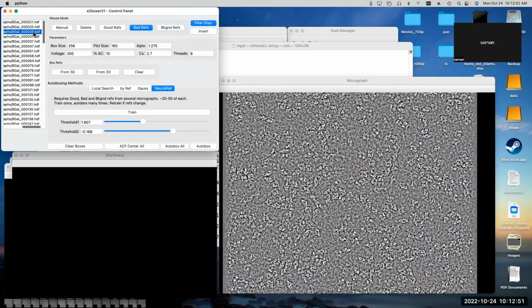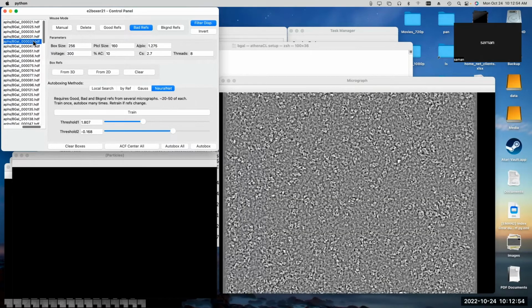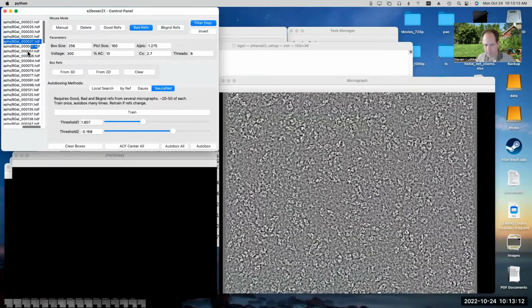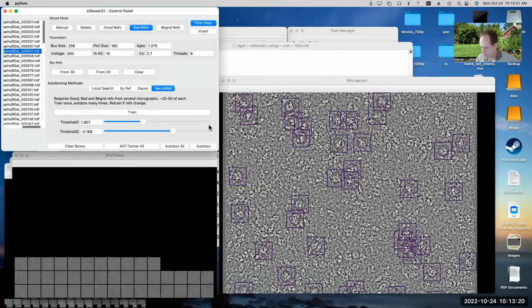I have a question. So if the final resolution of the 3D structure is disturbed because of the bad references, how can we identify that? Like you said, sometimes it is the resolution, sometimes it's the structure. So how can we identify if the structure is disturbed because of bad references, like 10 to 20%? So it's not bad references, it's bad particles. Bad particle. We'll have to talk about that once we're at that stage. I can't explain it easily where we are right now.